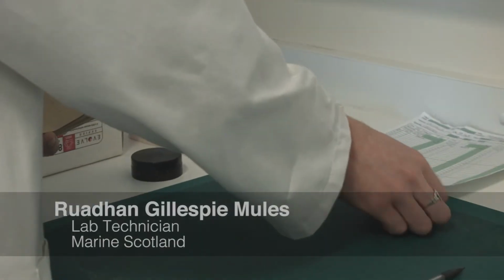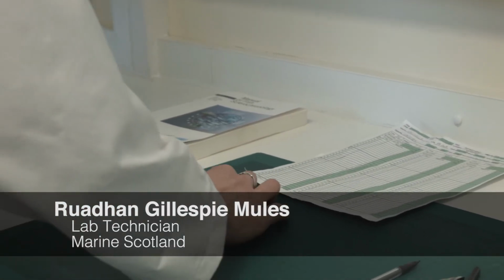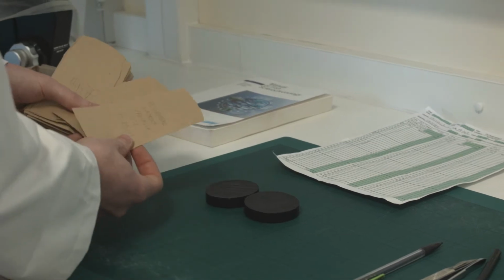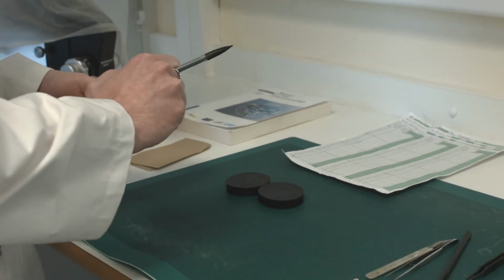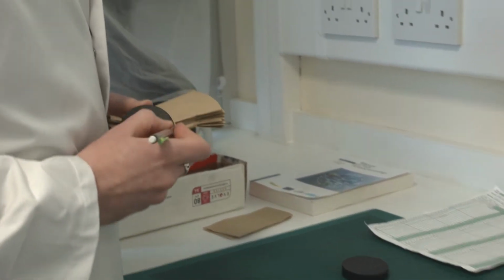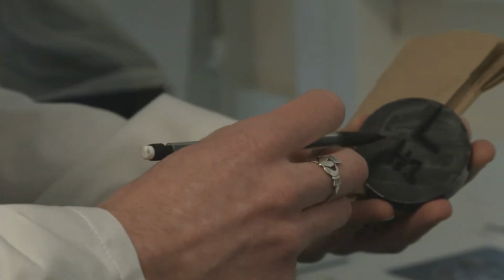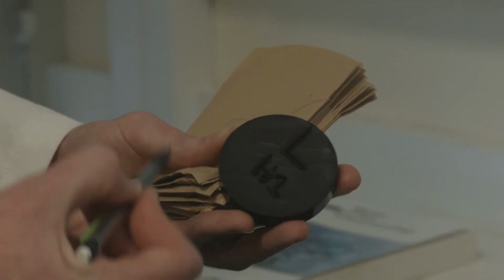So we've got the paperwork and the otoliths here, and now we have to mount them. We mount them in sets of 5 to make reading easier, so we remember the ages. So we know which category these two are from. A stroke, and on the mount themselves, so we've got haddock, first mount, and where we start, just read in the clockwise direction.